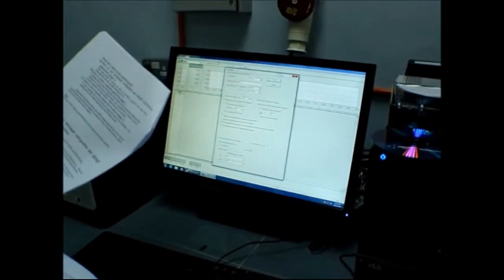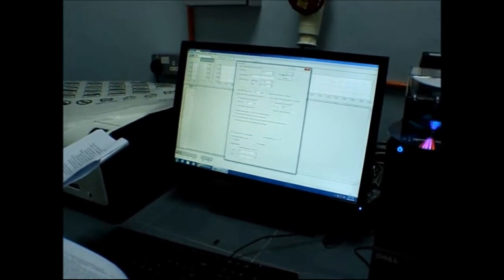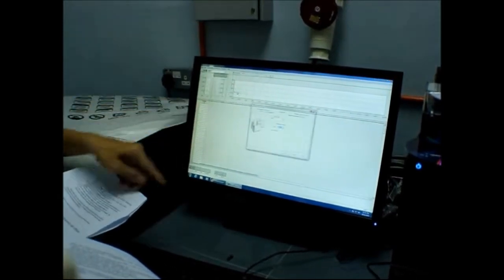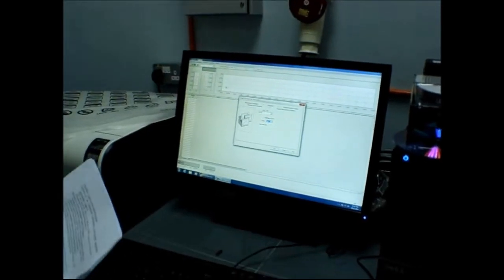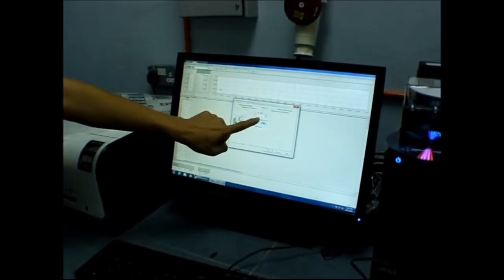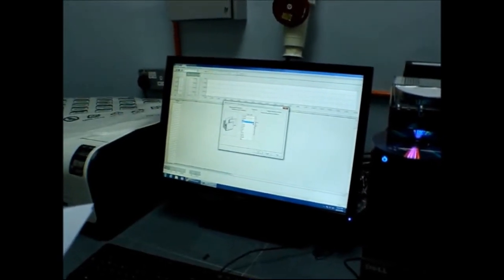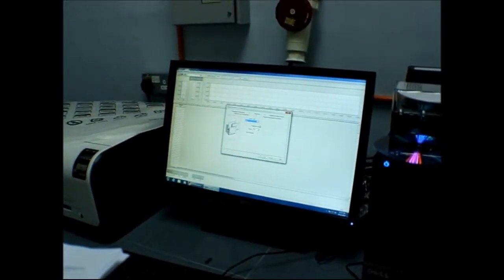Then you go to parameter, default parameter, flame continuous. This is called flame analysis. So it's flame continuous. So you write down your unit. What is your unit? ppm, right? ppm or milligram per liter? Same, because you are using water. Water is the same.